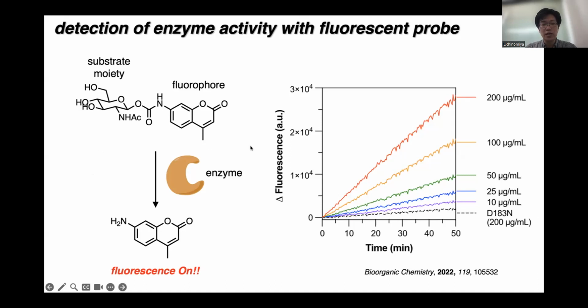And as you can see, the fluorescence increases in a time-dependent and enzyme concentration-dependent manner.